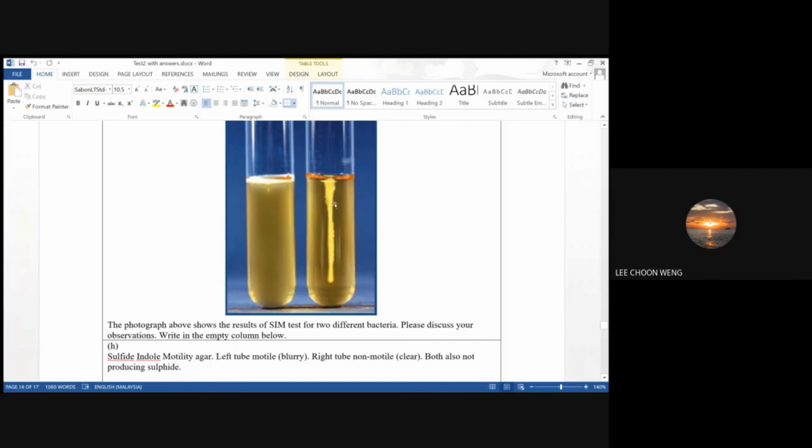Okay, like this. So this is a very beautiful picture, but in actual lab work, it is very, very difficult to stab steadily because most of the time your hands will shake and you will get a very, very big stab.